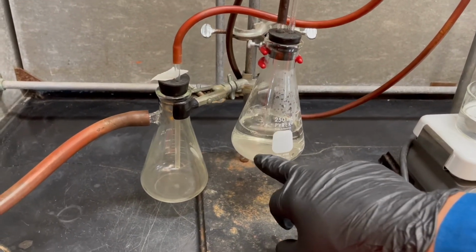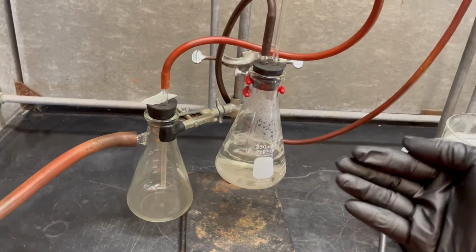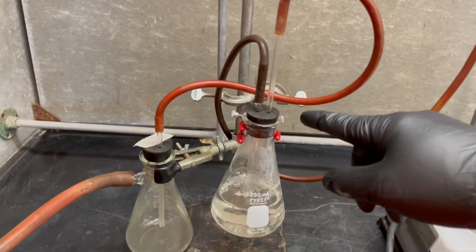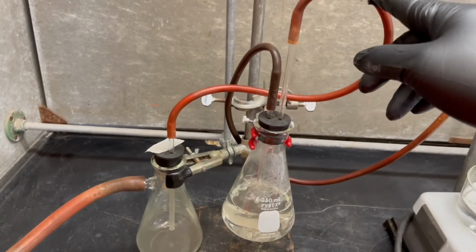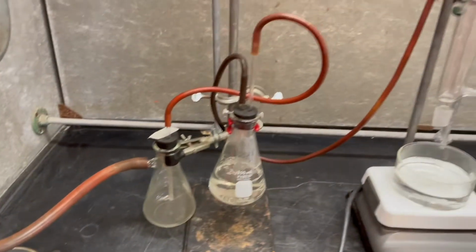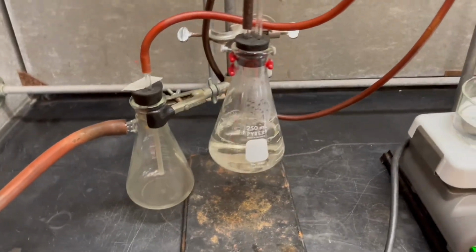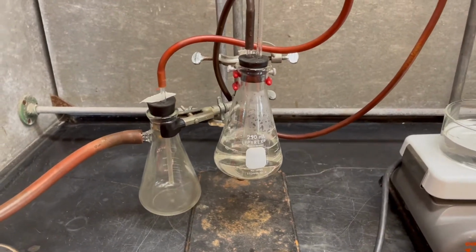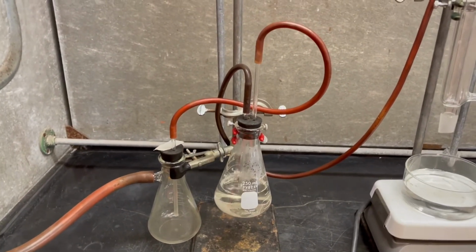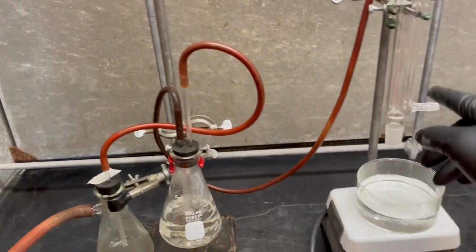I made it about a 10% sodium hydroxide solution so that it kind of quenches the gas, and so it's not everywhere and just spewing about. And then this tube right here just leads to the vacuum. So this vacuum is being pulled to force things to go through that way and bubble through this sodium hydroxide solution. It's there as a way to help prevent this sodium hydroxide solution from getting sucked up into our reaction.